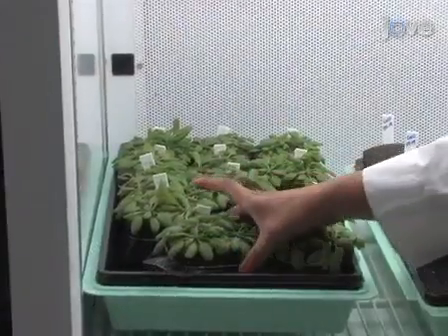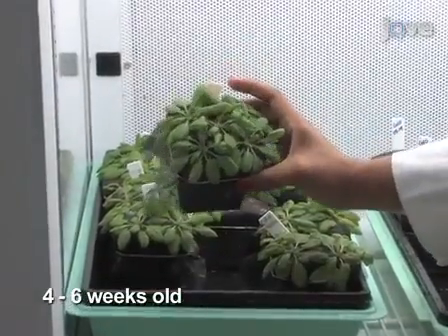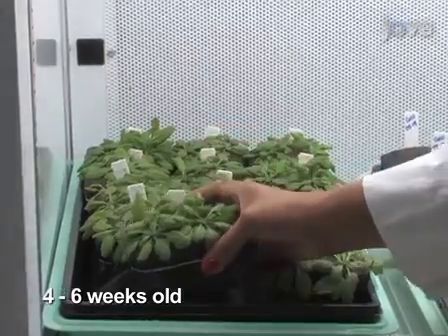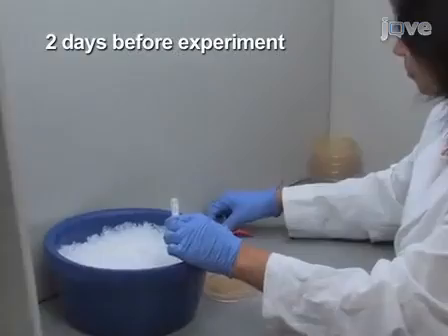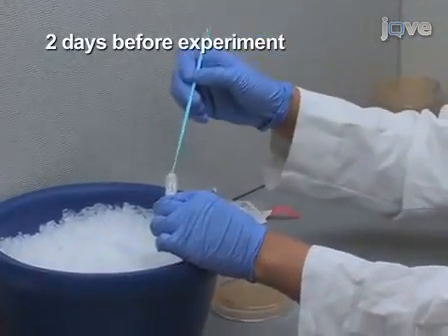The plants are ready to use in 4 to 6 weeks when they have young, fully expanded leaves prior to bolting. 2 days before starting the experiment, prepare the bacterium culture.